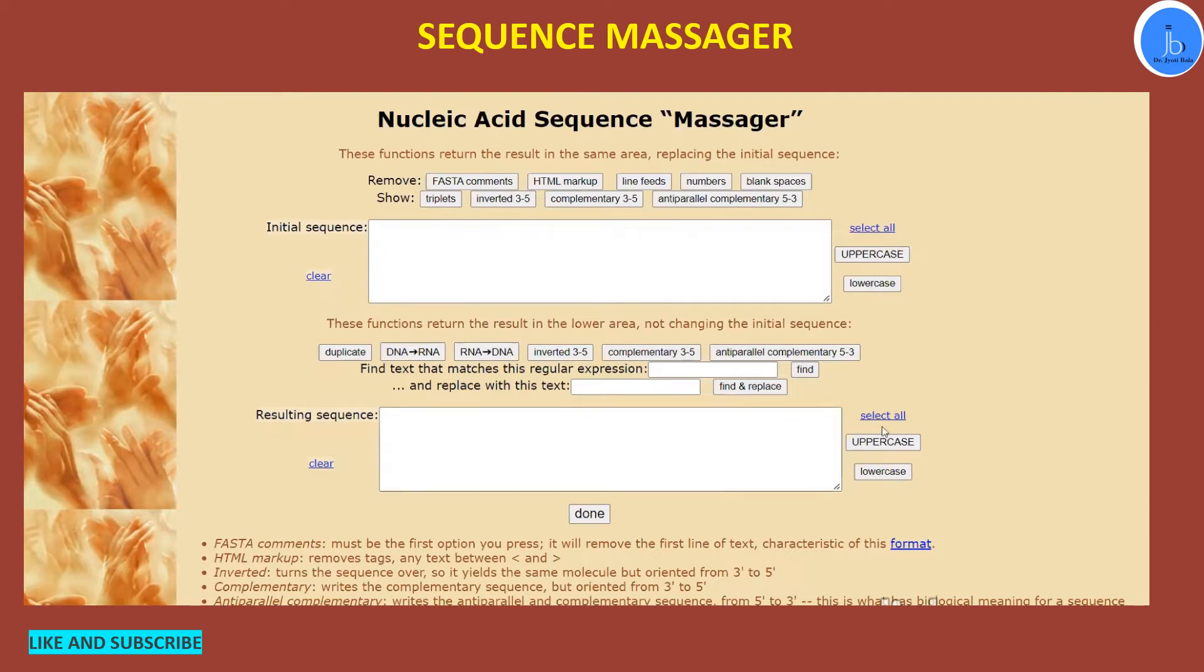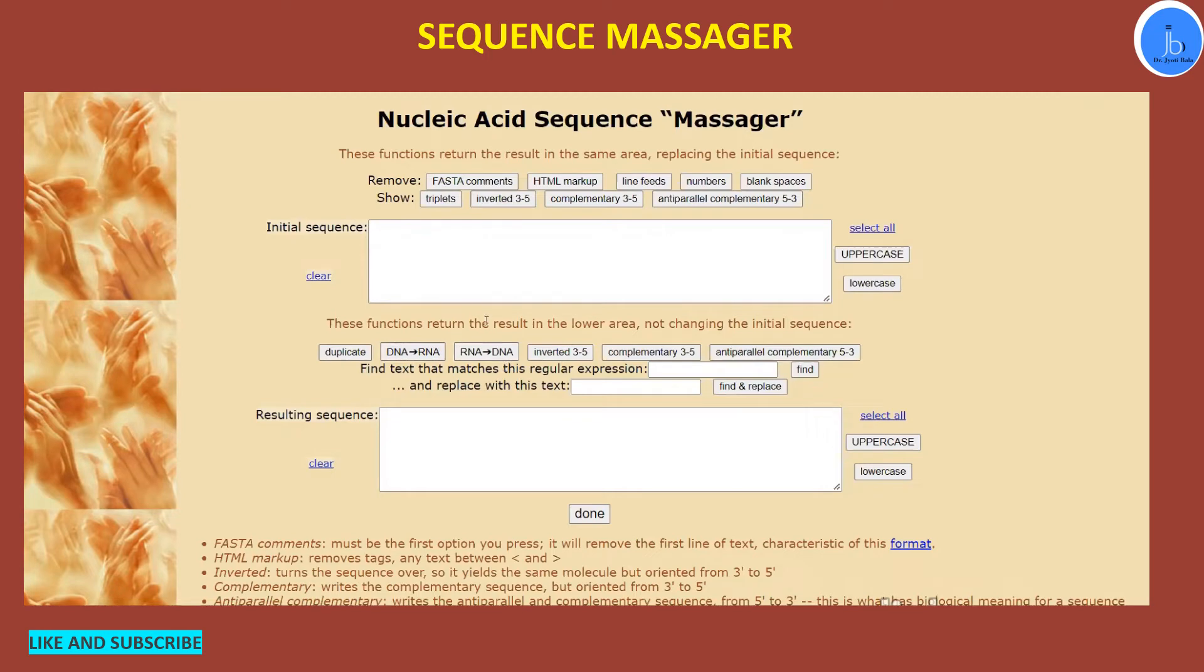On the top panel, you will get a lot of options to either remove the line feeds, the numbers, and the blank spaces. And in the bottom panel, you will get the options to convert your DNA to RNA, RNA to DNA, you can convert your sequences to complementary sequence, and so on.